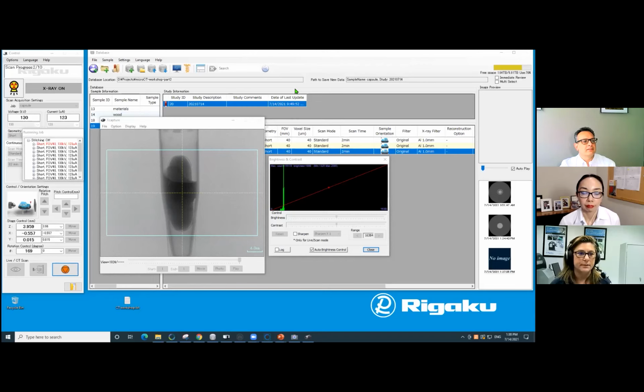Yes, absolutely. So if you've seen some of our earlier workshops, then you would have observed that absolutely for some samples, orientation is extremely important. So I would recommend you go back to see our first micro CT workshop, where we looked at that in the case of one sample. So basically, when you're thinking about how to orient the sample, one of the things that you want to make sure of is that the path length through your sample is pretty much the same throughout the entire scan.